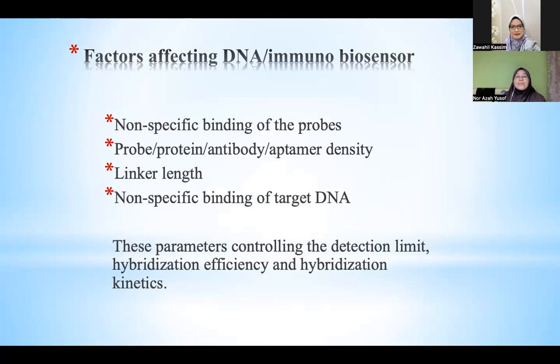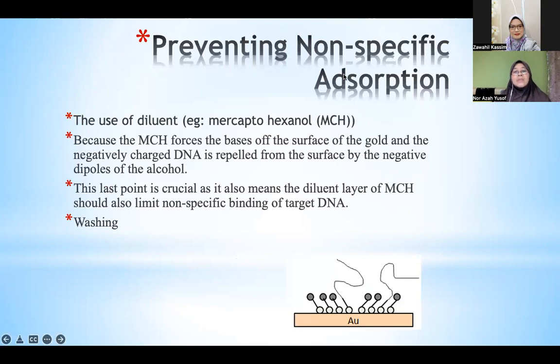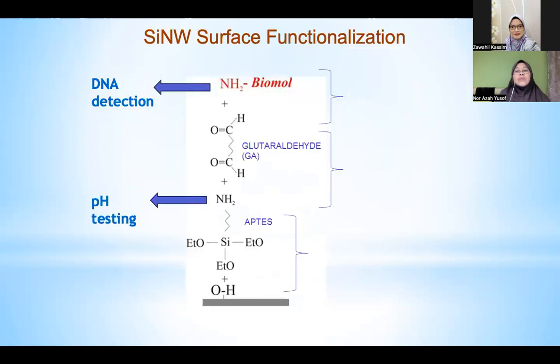It's not that difficult. So the last issue that we need to think about is how to avoid non-specific binding. I mentioned just now that we have possibilities of other DNAs from other species, or there's so many of what they call rubbish proteins. How do we avoid them from interfering with the sensor surface? So this is mercaptohexanol. One thing is when we put the spacer just now.